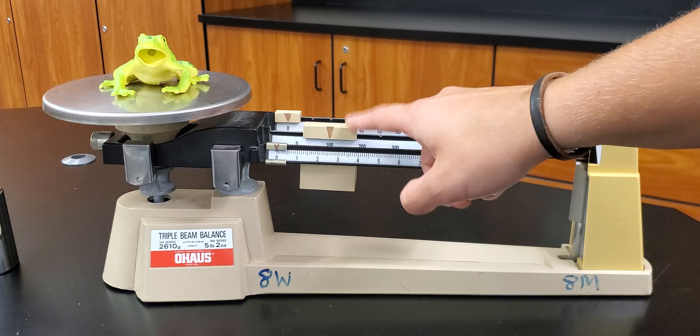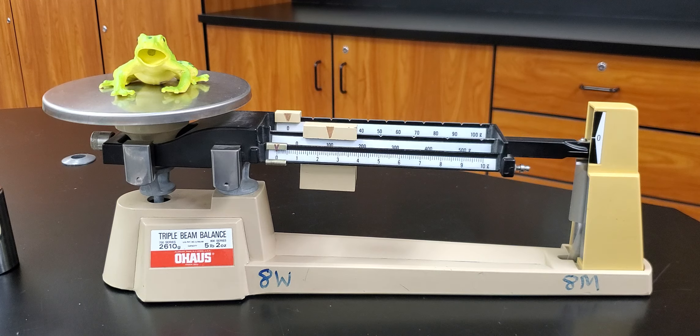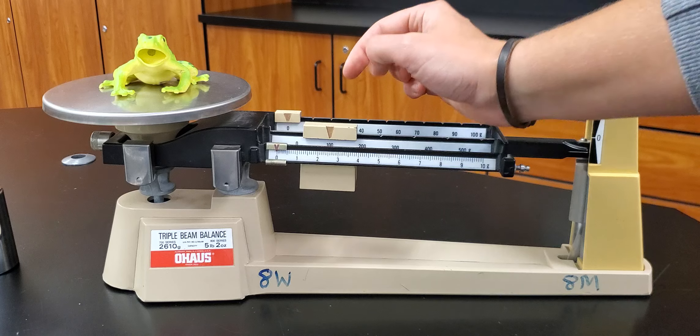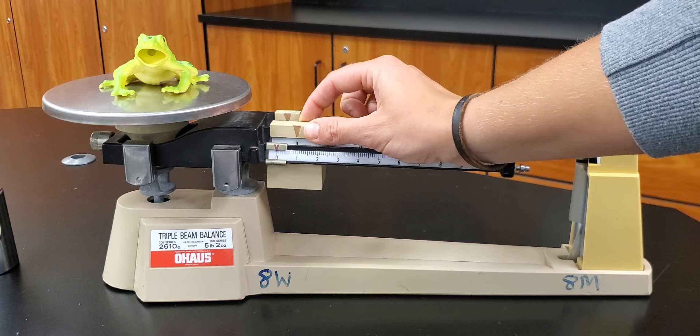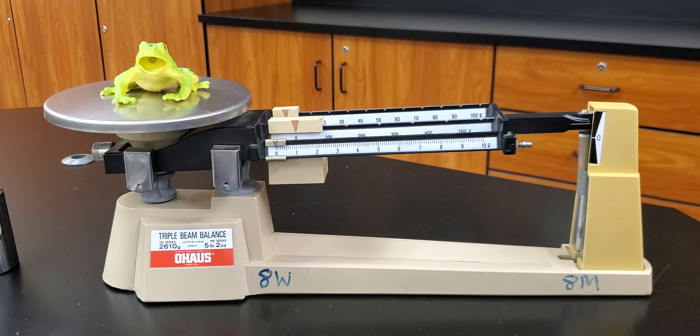So it's clicked into place and if I let that beam go you'll see that the arm moves down. That means I have too much weight here. This frog has a mass of less than 100 grams. So 100 is too much. I'm gonna back it back up to zero and make sure it's in that zero slot.